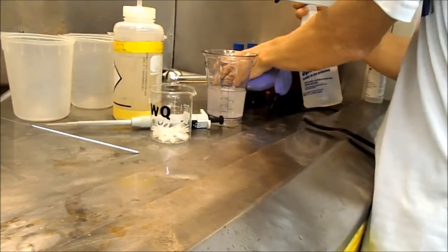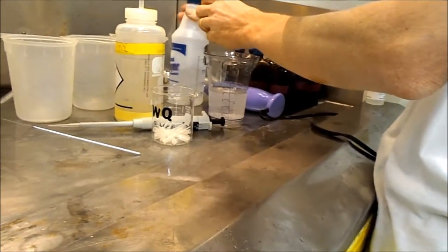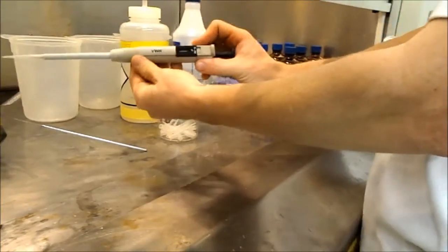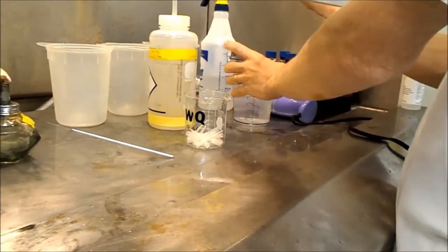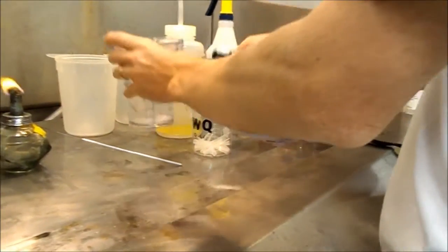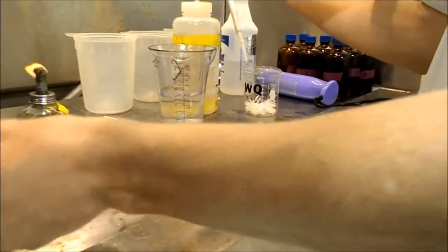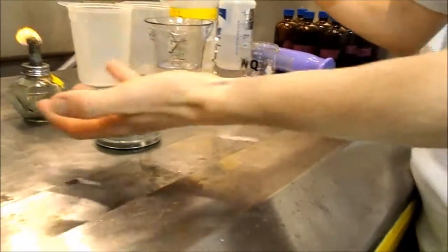Sterilize the blade after each time. Yep, and then I'll rinse it with DI before I use it again. Good. We want to keep the top off the plate as short as possible.